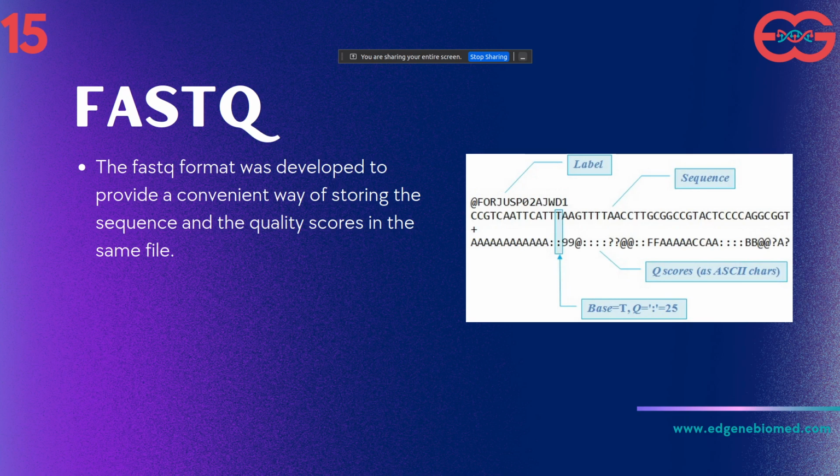I have told you that the machine has an efficiency of 97% or 99.7%, and we only want to stick to the reads which the sequencer is highly confident about, so that based on the quality of the data we can filter out the data where the sequencer was not confident. So that's why this Q is very important.